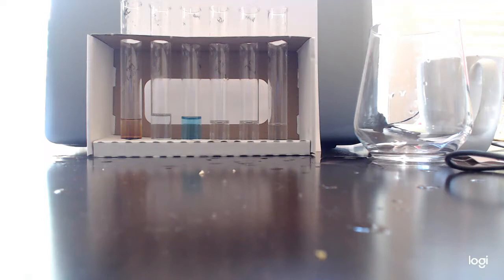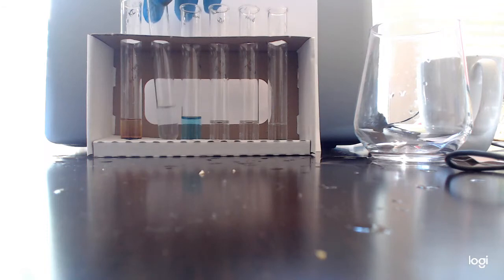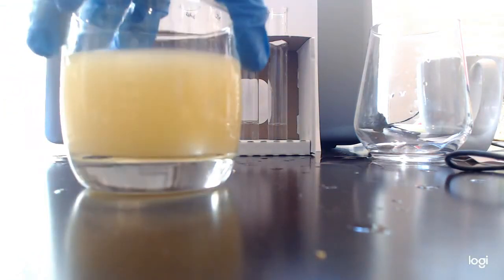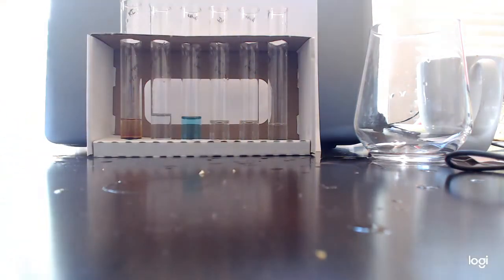So again, potassium iodide, ouch, tests for starch. That really hurt. Biuret test for protein. Benedict's test for sugar. The last substance that we're going to test for molecules is going to be our orange juice. I have gone ahead, gotten our orange juice, diluted it down, and we're going to be using, I think, 10 drops. We'll try 10 drops for our experiments. Let's go ahead and do orange juice in potassium iodide. 10 drops.